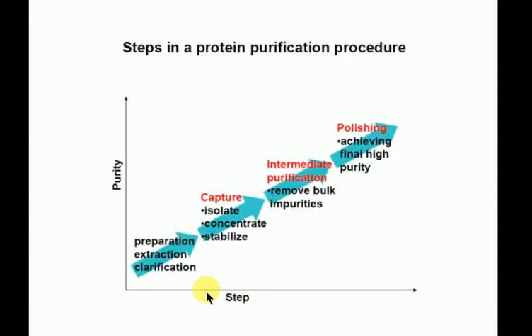So here are our steps. Now, usually, this is presented as a very linear flow scheme. But it's not always the case, right? I just told you earlier, you can lose your sample quite easily. It sticks to things. Maybe it aggregates over time. Maybe you've got to be quick because your protein is unstable, right? If your protein is unstable, then you might have to commit to doing it all in a day.